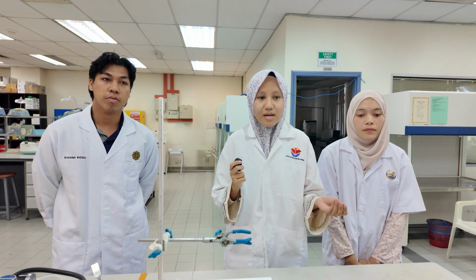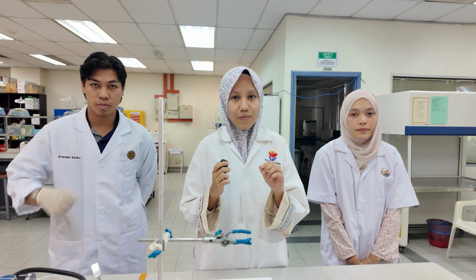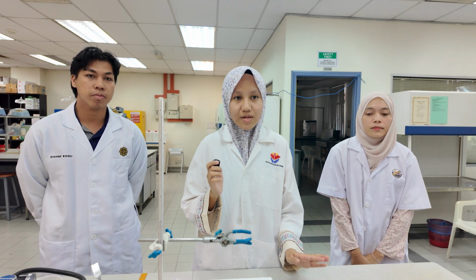It is because an ideal solvent can dissolve a large amount of compound when it is hot, but when it is cool, it will only keep a small amount of compound. We have to choose the suitable solvent to make sure the product we produce is larger and purer crystal.